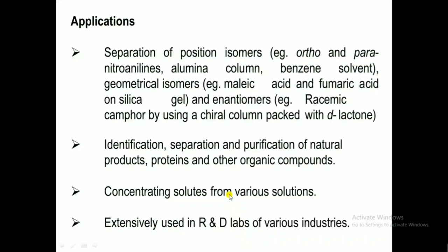Then you take another fraction of your mixture and again do the chromatography separation, so you will get the next 5 beakers with 5 different components. Beaker 1 in the first separation and beaker 1 in the second separation contain the same component. So if you add those 2 beakers together, that means your component is getting concentrated.